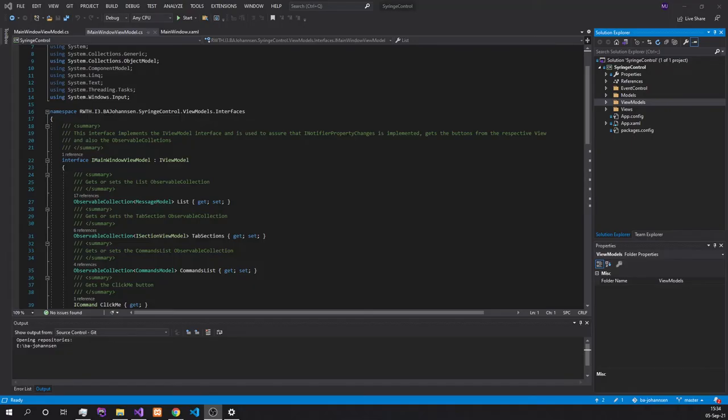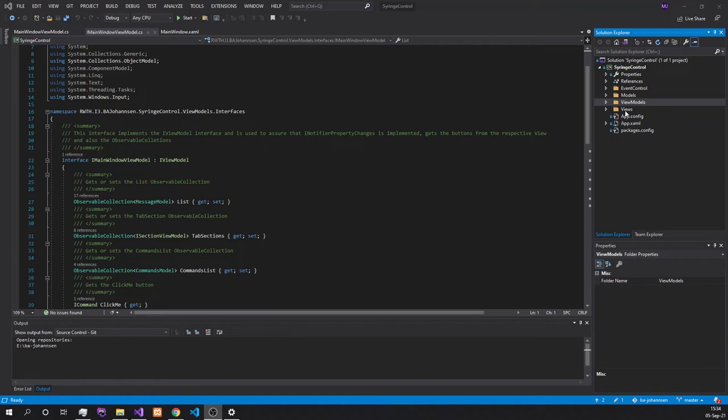Now I'm going to explain the user interface as well as the domain-specific language with the help of a technical walkthrough. For the user interface, we're using the model-view-viewmodel pattern, and thus we are dividing the files into the model, the viewmodel, as well as the view files. Additionally, we have an event control folder for the aggregator as well as the command handler.